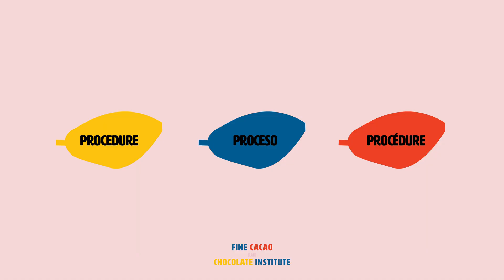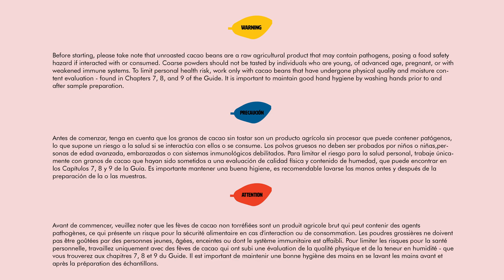Procedure to prepare samples. Before starting, please take note that unroasted cacao beans are a raw agricultural product that may contain pathogens, posing a food safety hazard if interacted with or consumed. Coarse powders should not be tasted by individuals who are young, of advanced age, pregnant, or with weakened immune systems. To limit personal health risk, work only with cacao beans that have undergone physical quality and moisture content evaluation, found in Chapters 7, 8, and 9 of the guide. It is important to maintain good hand hygiene by washing hands prior to and after sample preparation.